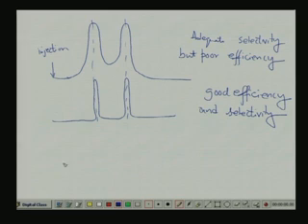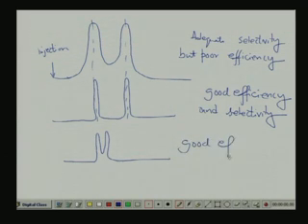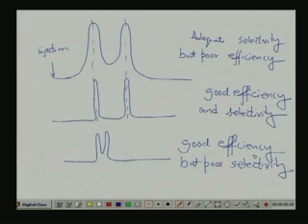And you see this another one, where you can see like this one. This is a good efficiency but poor selectivity. Okay. So, selectivity, efficiency, I mean everything we have discussed for the two columns in this particular slide, right.